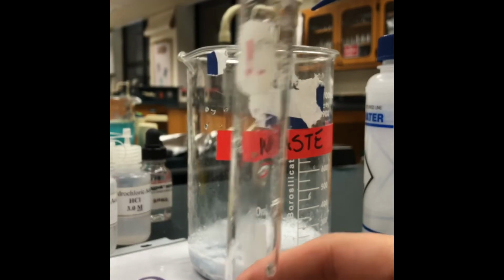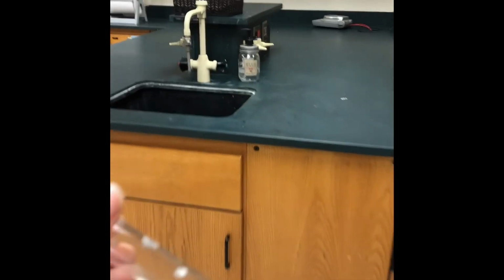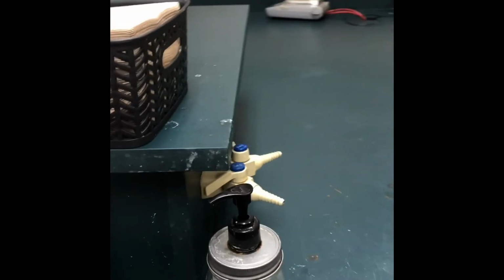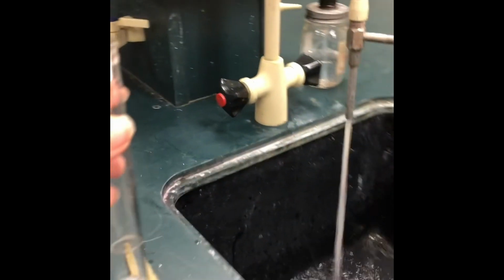And so I want to remind you again that washing is not done with just water. You really need to get your scrub brush out. Remember that for all things in the lab. So you want your scrub brush and you want soap, right? So I'm going to put a little soap in here. You don't need a ton. Run the water. Good. Right, and then now scrub with your scrub brush.